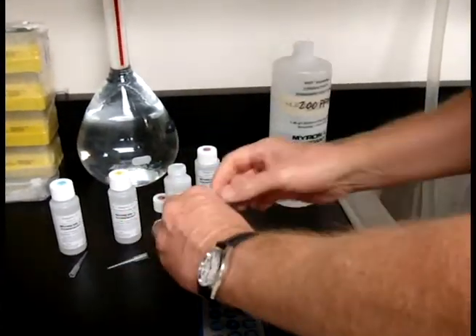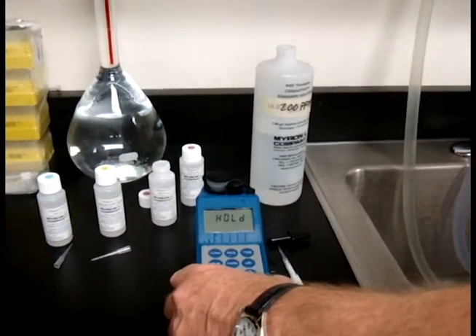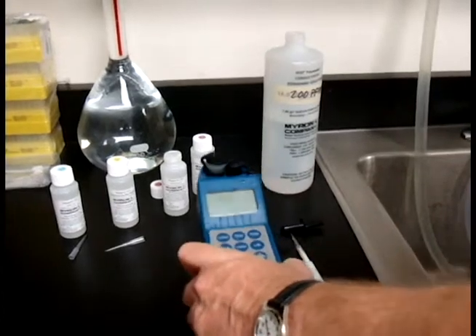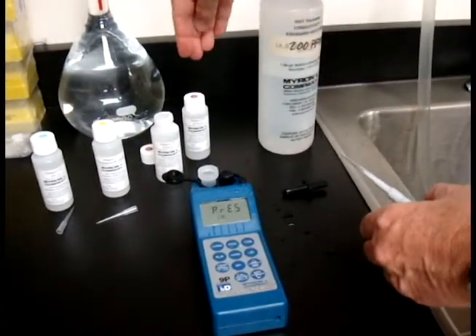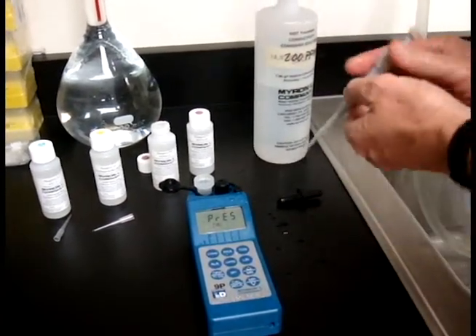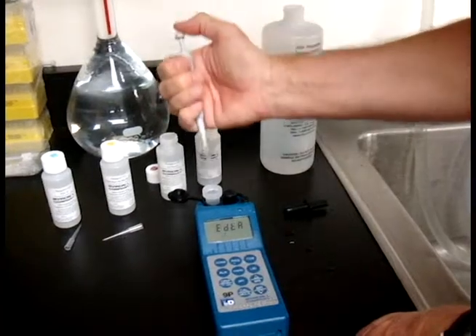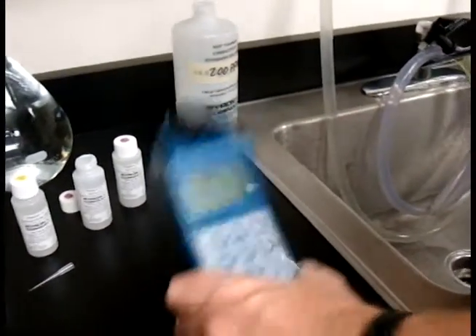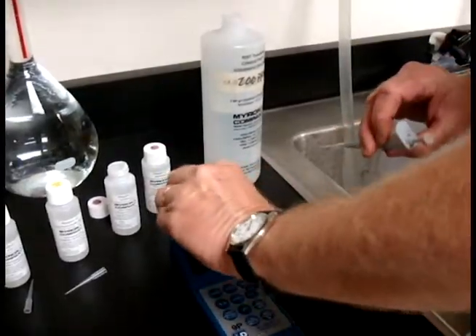Put the EDTA LC in and agitate, then hold. Press Cal and take the lid off. Note: if you had a high concentration solution, you'd want to use HC — it would call that out here as HC. Today we're using a low concentration, so LC will work fine. Hit Cal again, add EDTA LC, agitate, hold, and we're ready for the next one.